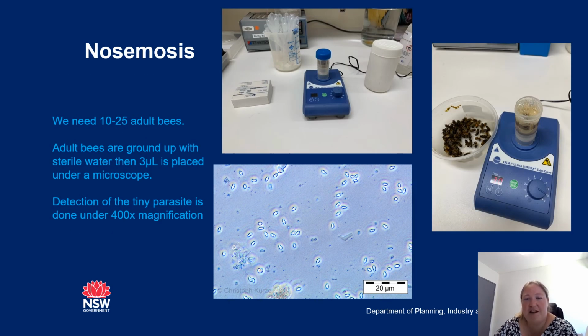This page here is our Nosema testing procedure. For Nosema testing, we need 10 to 25 adult bees. Now you can send them in to us like this one in a container. They're already dead. Or we like them also preserved in some alcohol.